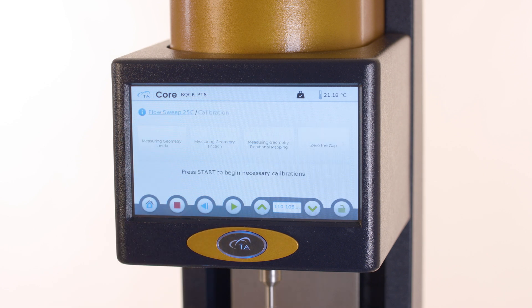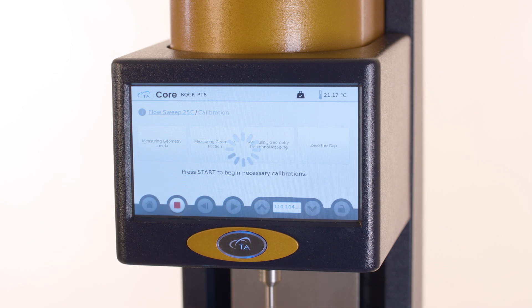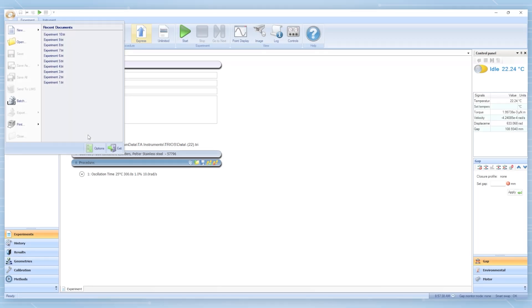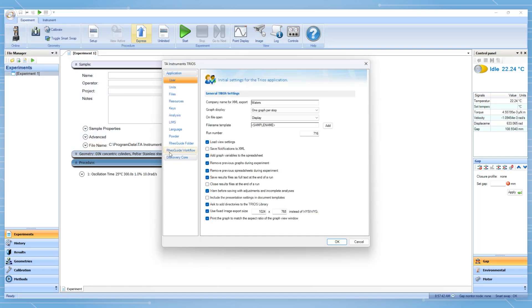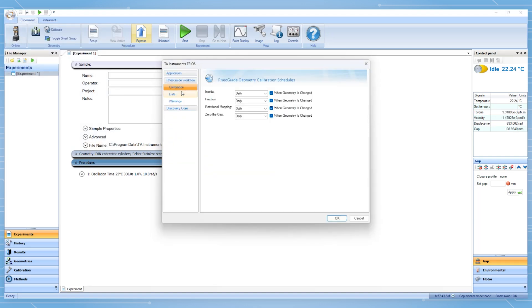Press start to initiate the calibrations. At the beginning of the calibrations, the test temperature is commanded. The calibration schedule is defined in the TRIOS options as shown here.